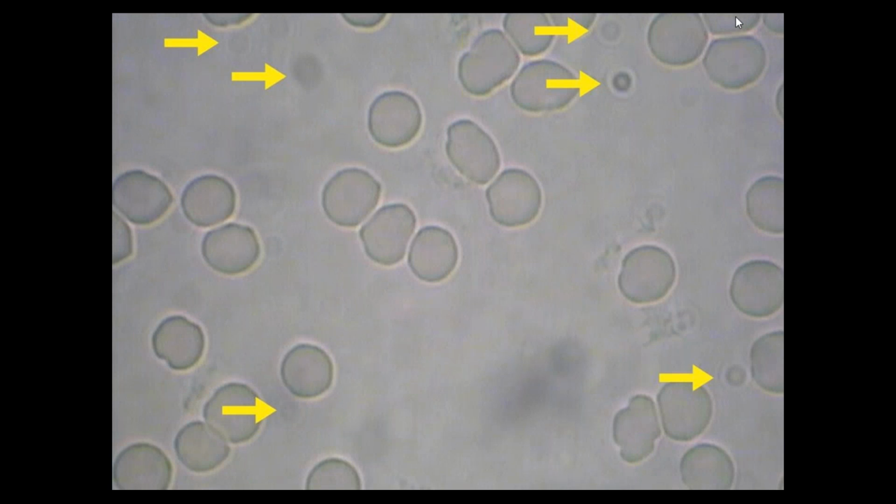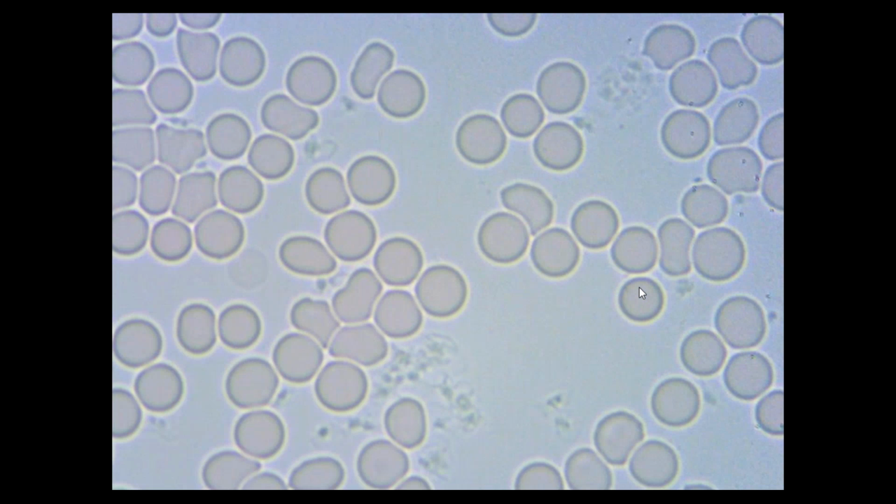Using a camera like this, I suppose you do get used to the spots and you learn to ignore them. But each and every client will ask you what the spots are, and that can become quite frustrating. Now the image that we have next is with an HD camera that's specifically developed for microscopy. As you can see in this image, there aren't any spots visible. Yes, that's much better.